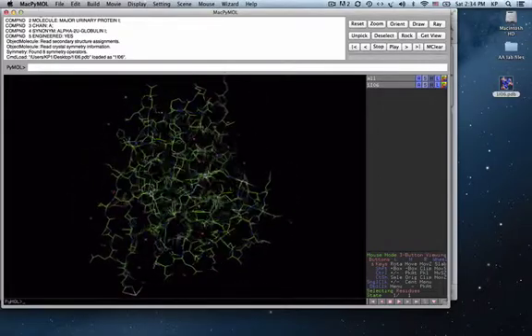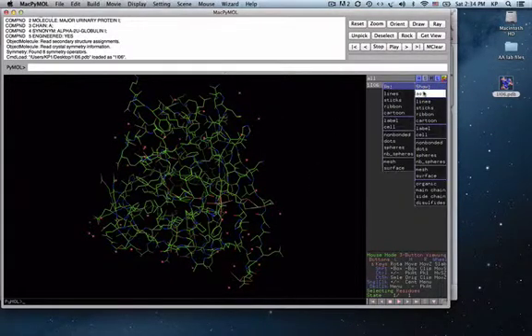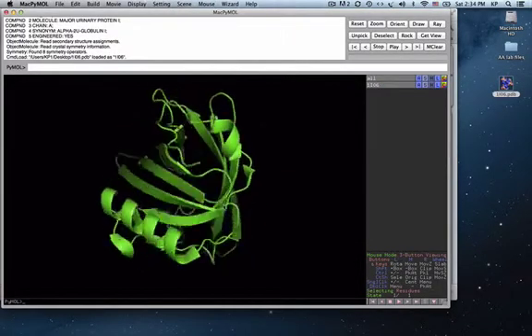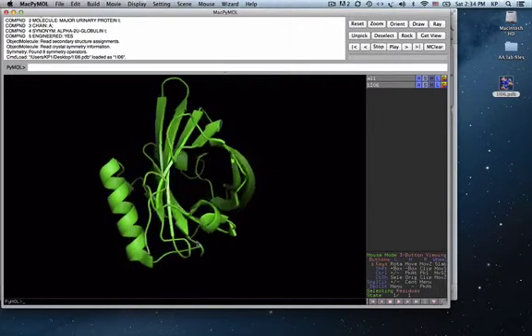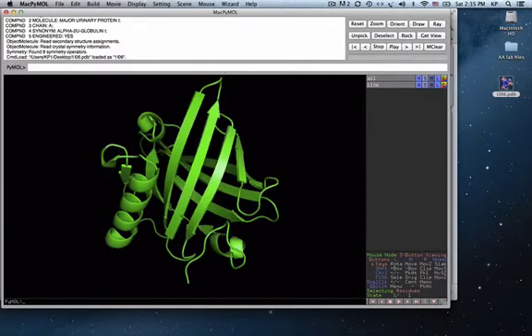So when this comes up, it's displayed as lines, and it's very busy. We can already start to see that a protein is a little more complex to view. We're going to show this as a cartoon, and we can now see this beta barrel structure that they talk about. Right now we're kind of looking down the center, and this is the binding pocket where the ligands will bind. This is an alpha helix right here, and there are these short helices called 310 helices. The beta barrel is just made up of beta sheets, and you actually did see these when you did your alpha helix section and your beta sheet section of the tutorial, because I simply cut these sections out of MUP for you to look at hydrogen bonding.